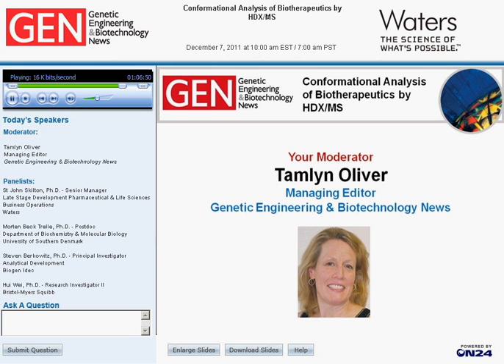And for protection factors ranging from 1,000 and up to millions, there is no correlation between B factors and protection factors. So that is the level of protection.